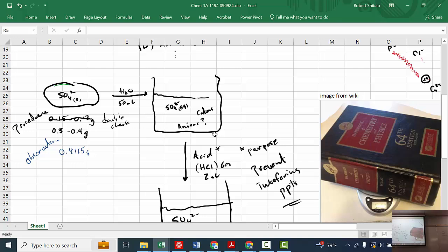The desiccant is this blue stuff on the bottom. When it's blue, it's good. It'll absorb water. When it turns pink, you see some pink ones there? Those are bad. Those have already absorbed the water. And so the color changes depending on how much water those have absorbed. And so we'll let this cool down.